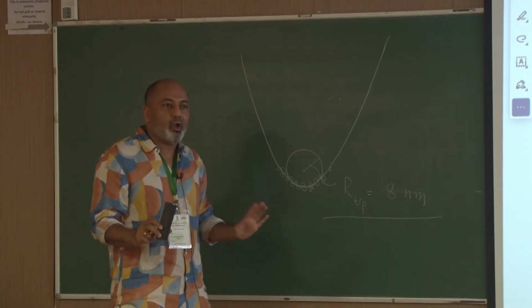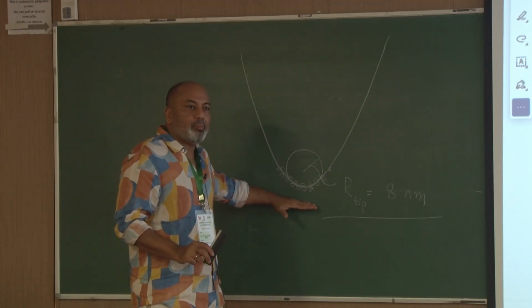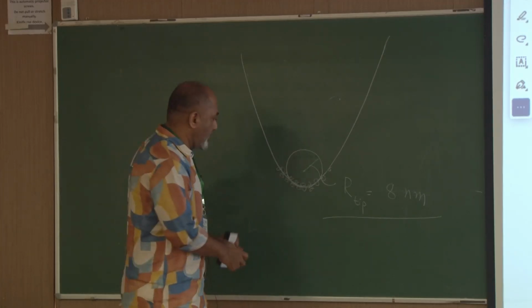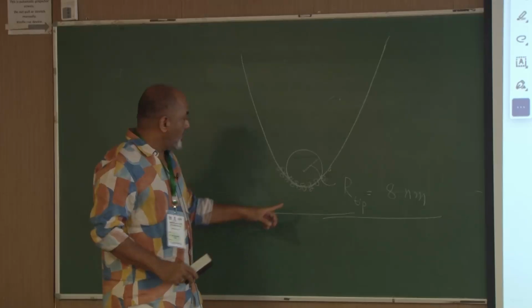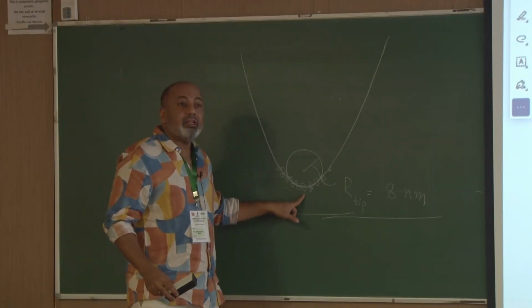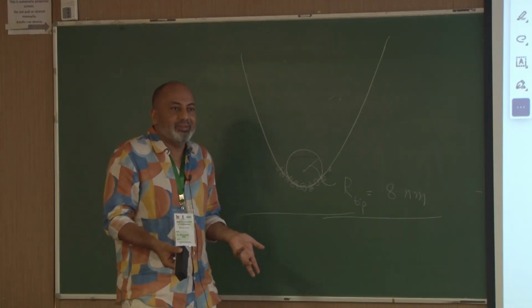So what does it depend on? Not only how it looks, but which phenomenon you are using for sensing the distance between tip and sample. So suppose the surface is there. The front atom is 1 angstrom away, the other is a bit farther, and the tunneling current falls exponentially, which means the front atom is really at the front.